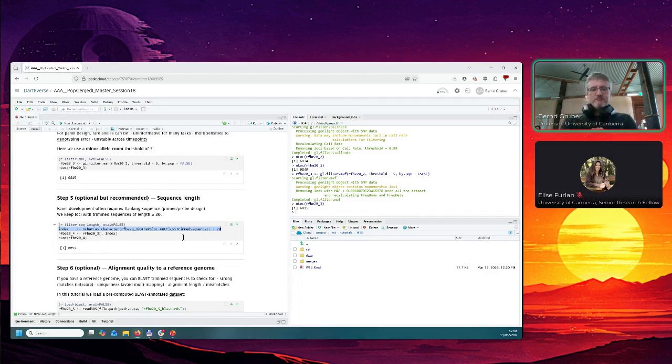If the length of this is less than a certain threshold, it's most likely that something happened with that SNP. It's not of high quality, so you don't want to have that, and therefore you also filter for the trimmed sequence lengths. Why 29 and 30 is just, can people hear me? Yeah.